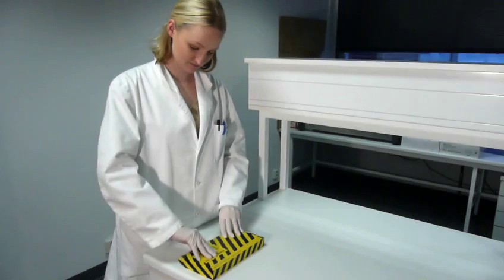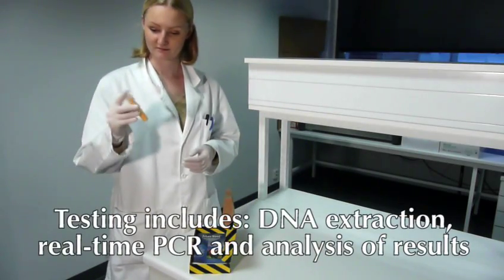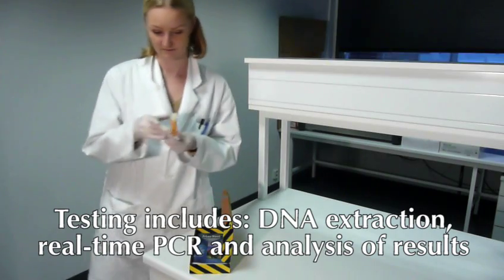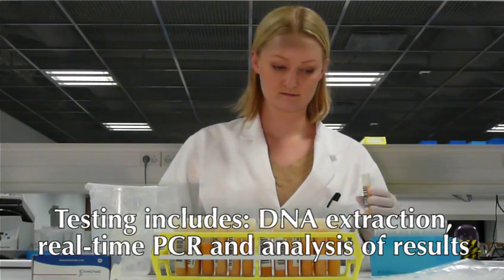The Pathoproof Mastitis PCR Assay is easy to use. The testing follows a straightforward protocol, including DNA extraction, real-time PCR, and analysis of results.